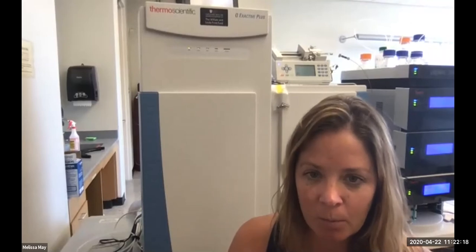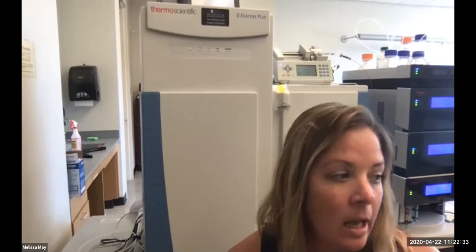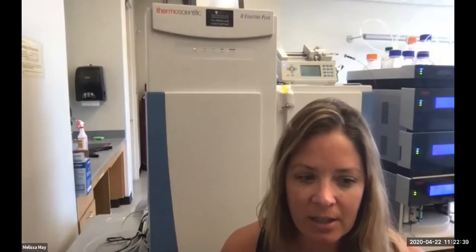If you are doing maintenance and you need to break vacuum, you turn off the electronics, then you turn off the maintenance switch, take these covers off and pull the instrument apart. And then when you put them back on, basically do it in the opposite order, so the electronics need to come back on last. If you shut the electronics off for any appreciable amount of time, the computer will tell you that they've been shut off and it needs, I want to say, somewhere around 80 minutes to re-equilibrate.